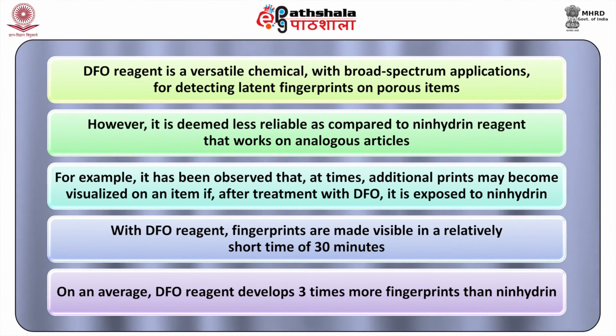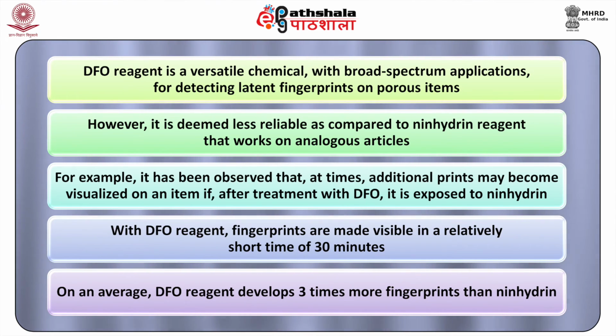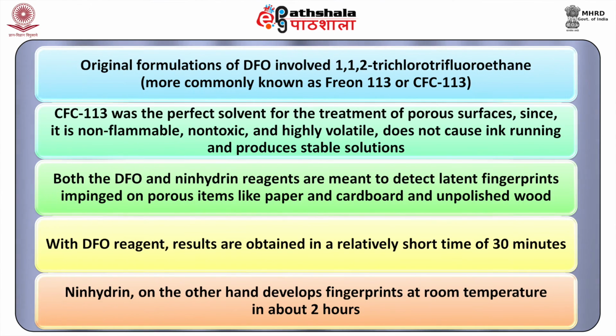Then we have come to know that with DFO reagent, fingerprints are made visible in a relatively short time of 30 minutes. And we have learned that on an average DFO reagent develops 3 times more fingerprints than Ninhydrin. Original formulation of DFO involved 1,1,2-trichloro-trifluoroethane, more commonly known as Freon 113 or CFC 113. CFC 113 was the perfect solvent for the treatment of porous surfaces since it is non-flammable, non-toxic, and highly volatile. It does not cause ink running and produces stable solutions.